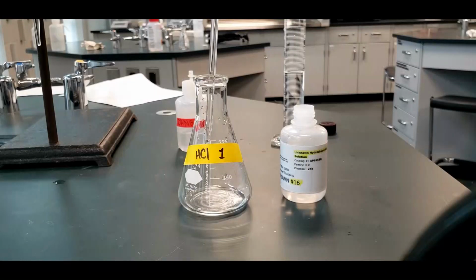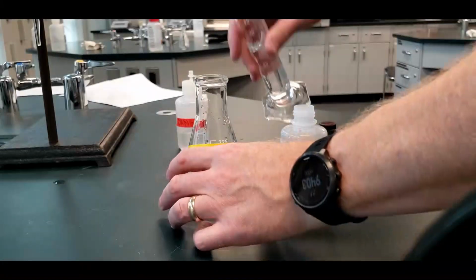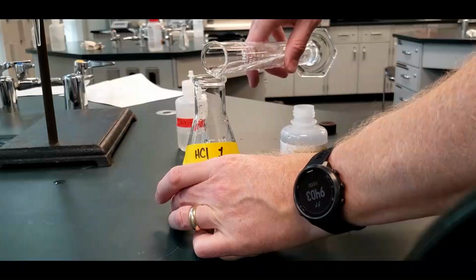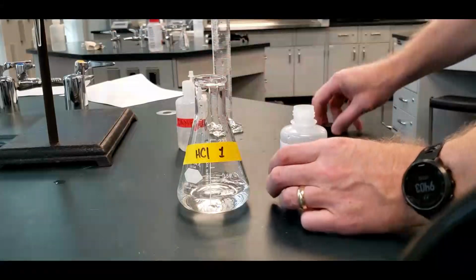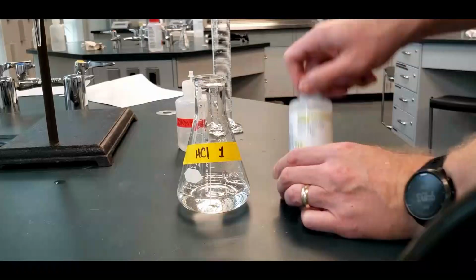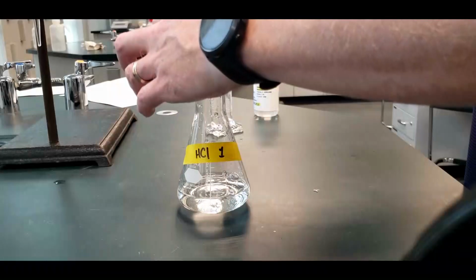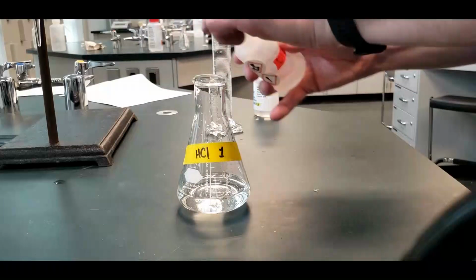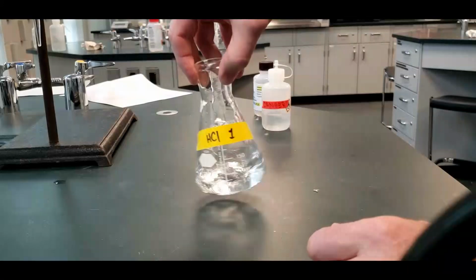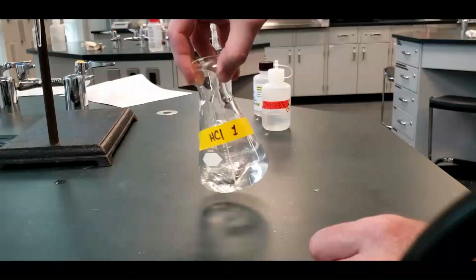And then we're going to add in 50 mils of distilled water. Normally I wouldn't have all this stuff clustered together. I just want to make sure everyone can see it in the same frame here. So we have the HCl, the water, and then 5 drops, 1, 2, 3, 4, 5 of our indicator. That's the first sample, and I'll do the other 2 the same way. And then we'll titrate.